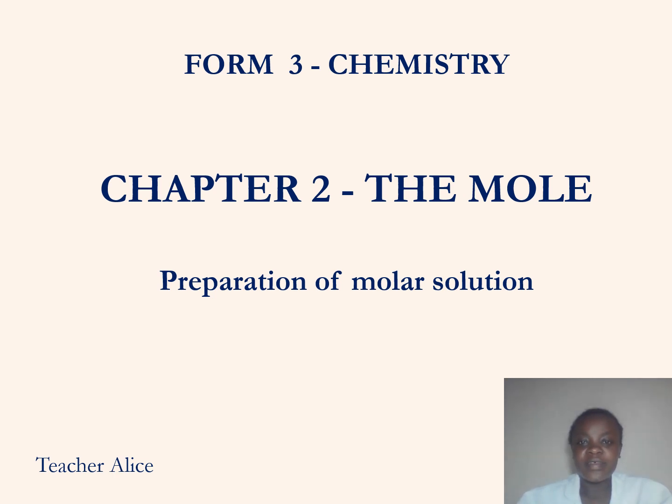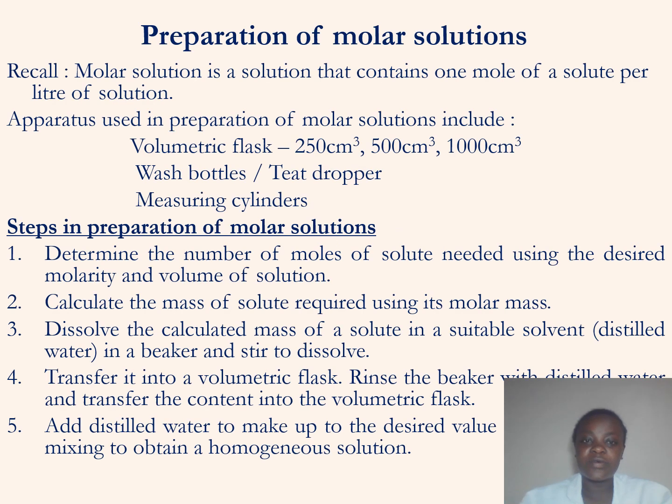We are still looking at Form 3 Chemistry, chapter 2, known as the mole. In our previous lesson, we looked at molar solutions, and two terms, molarity and concentration. We saw what a molar solution is, and today we are going to prepare molar solutions. This is part 6 of the chapter: preparation of molar solutions.